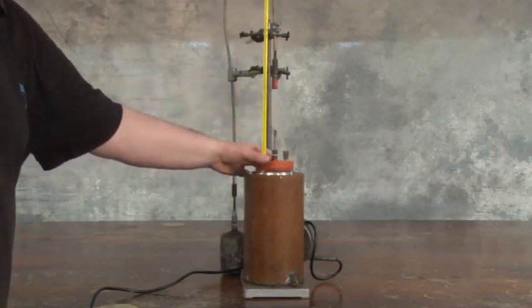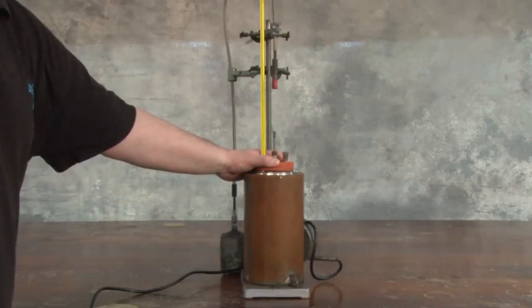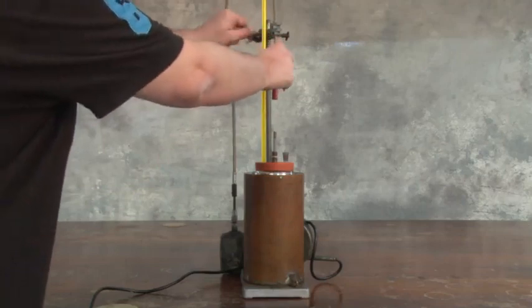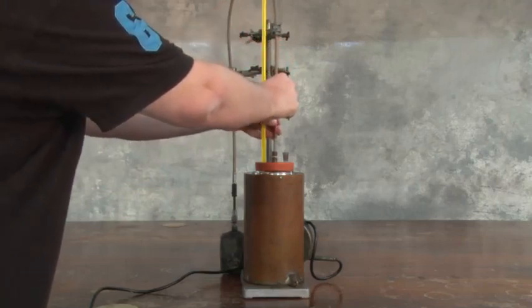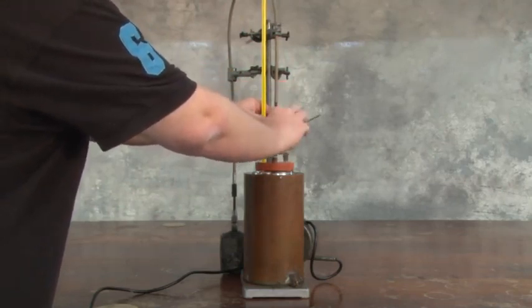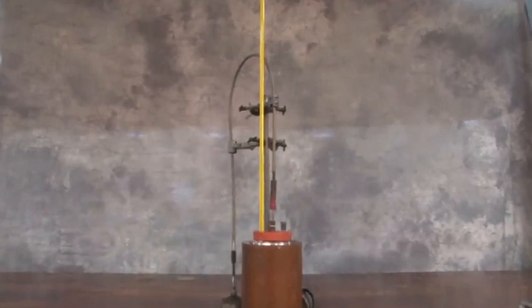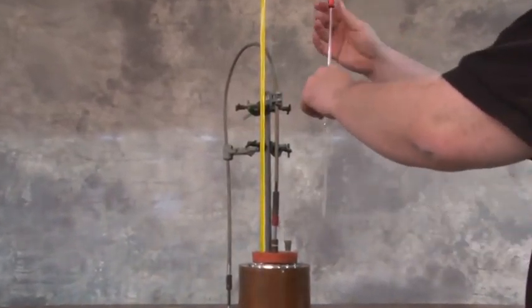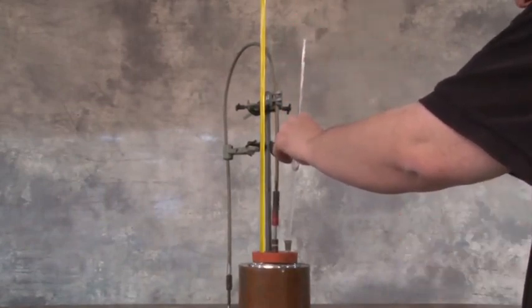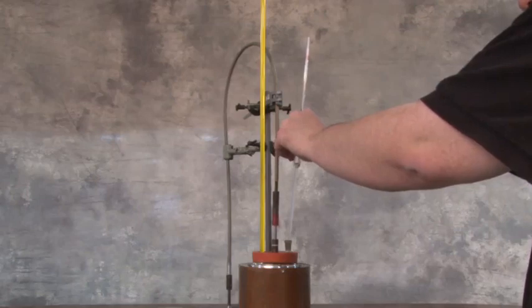Once again, place the lid on the calorimeter, being careful not to damage the thermometer, making sure the lid is tightly fitting. Then, attach the stirrer cable and tighten once again with an Allen key. Switch on the stirrer, then pipette 10 milliliters of the hydrogen peroxide solution into the calorimeter. Again, allow 10 minutes for thermal equilibration. We are going to skip this part.